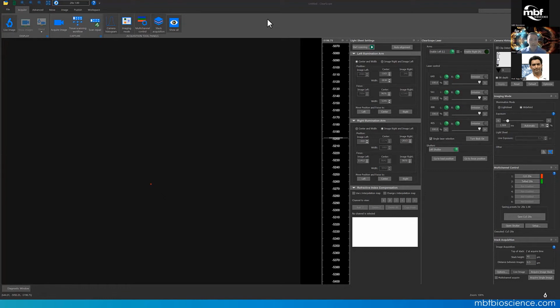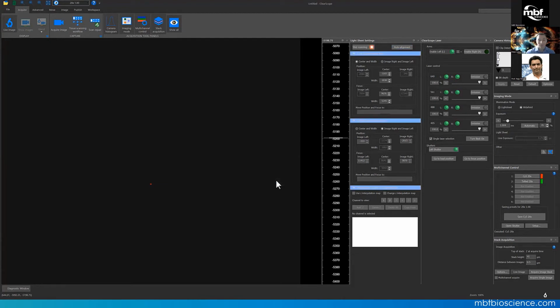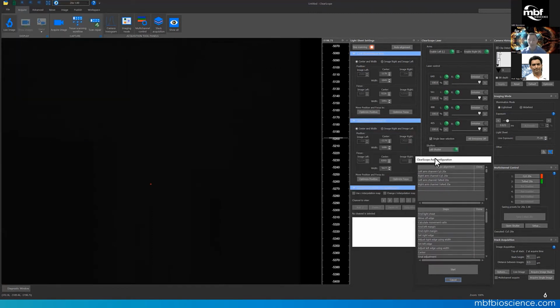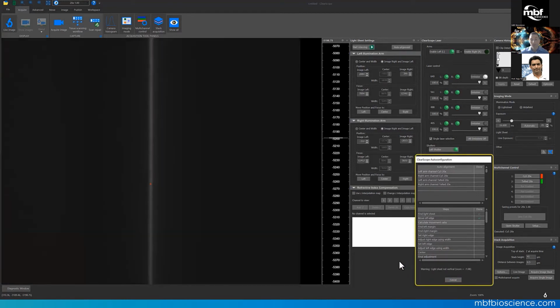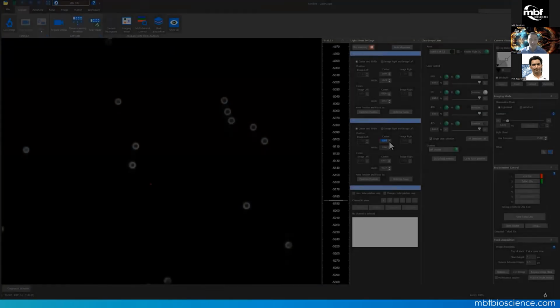So we essentially click the auto alignment button under the light sheet settings toolbar to start the light sheet optimization process. The system will perform a number of steps, such as determining the galvanometer scanning start and stop points for the synchronization with the rolling shutter exposure of the camera, and automatically adjust the ETL settings, ensuring only the thinnest part of the light sheet intersects the detection plane. The software will repeat this process for each arm and each channel.